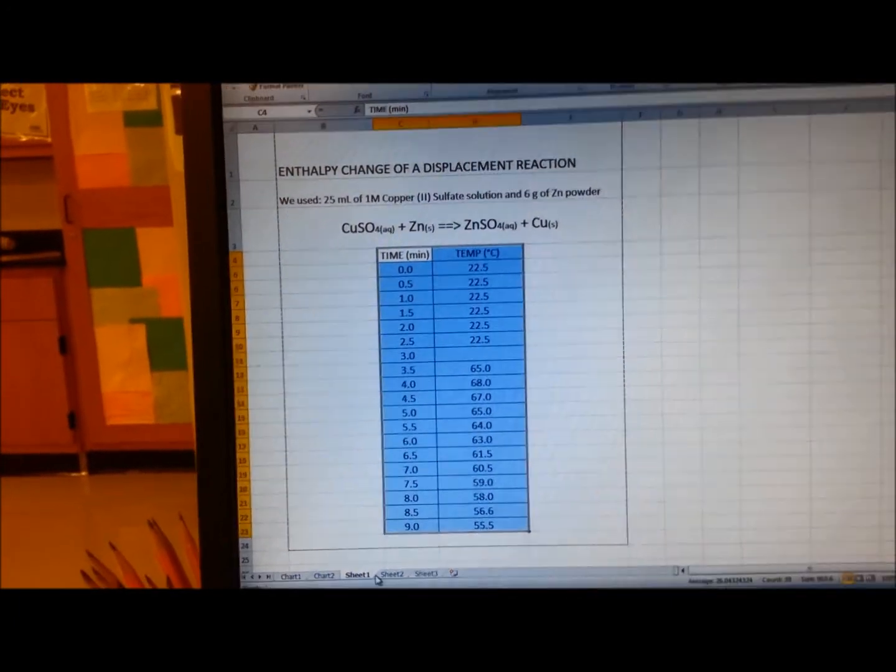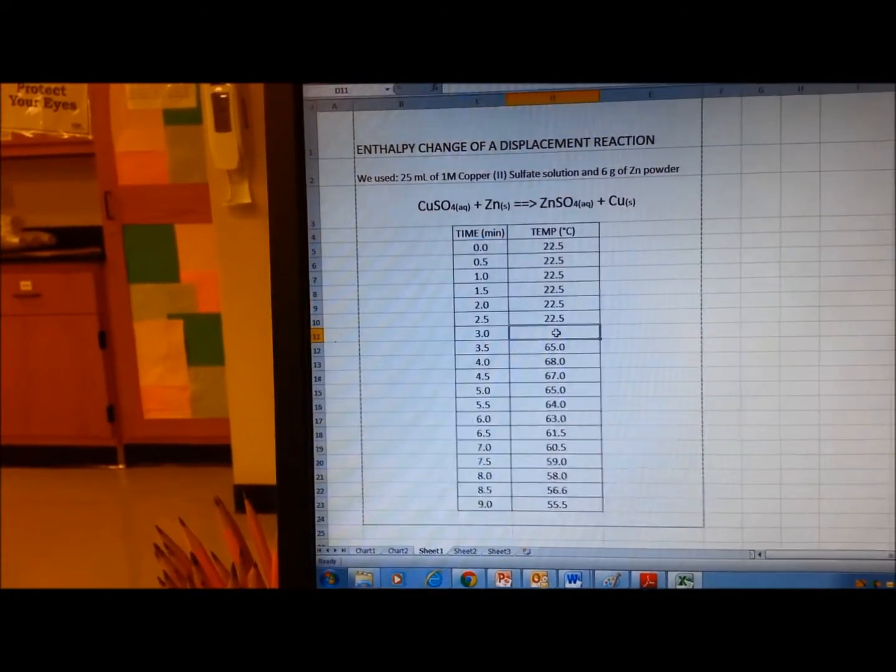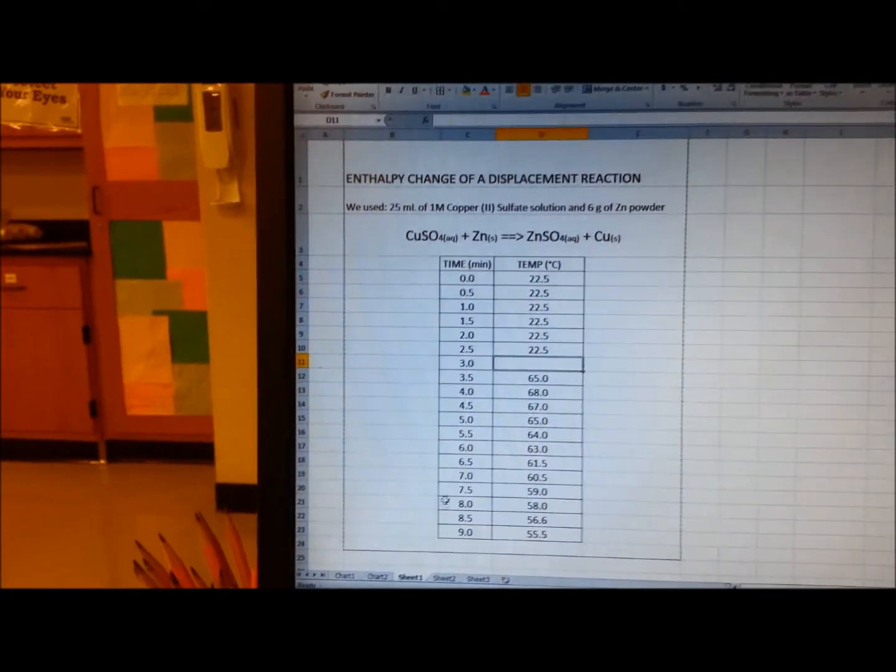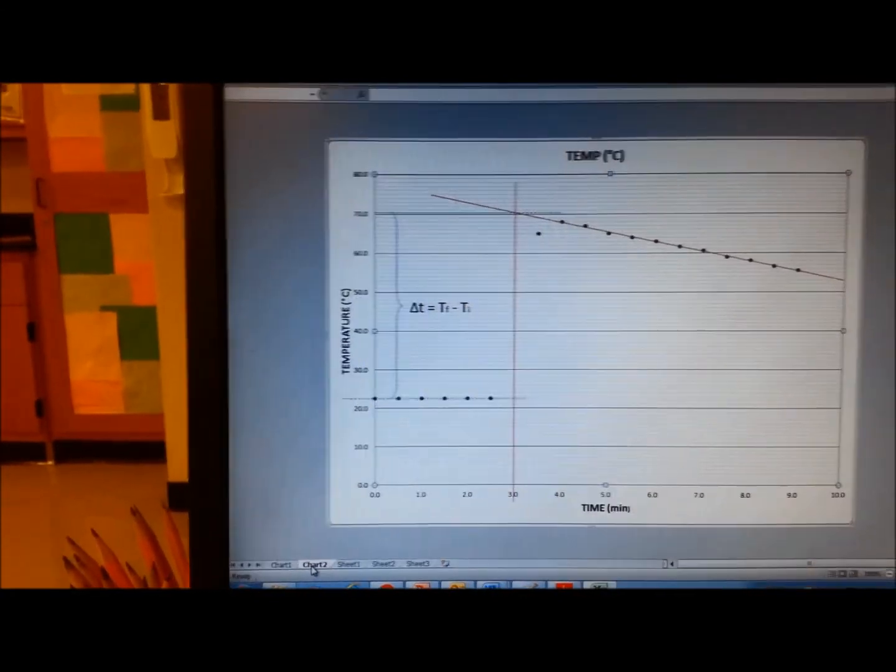We plug in all the information in Excel. I erase this cell so it doesn't give me any errors. And then we develop this chart.